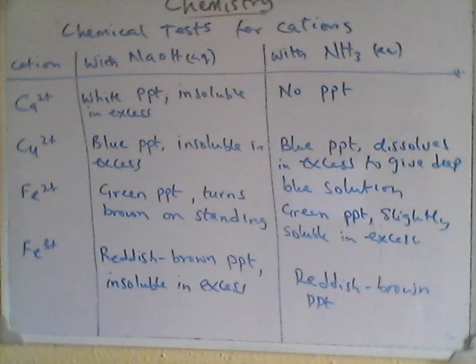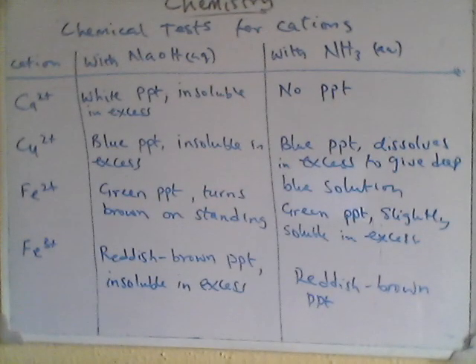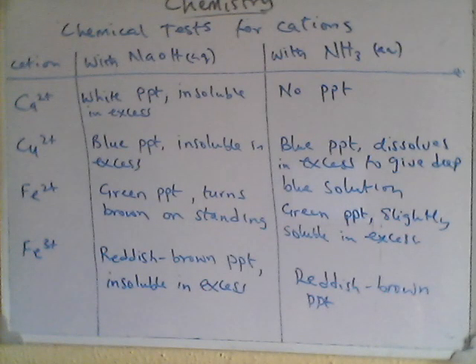Okay, so here we have a set of chemical tests for cations. We will look at flame tests, which are just a way of using flames to determine the metal ions present in a salt after it's been heated. The color of the flame determines the metal ions. So I've asked us to go and memorize those colors for easy identification.